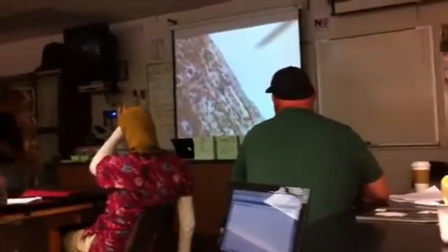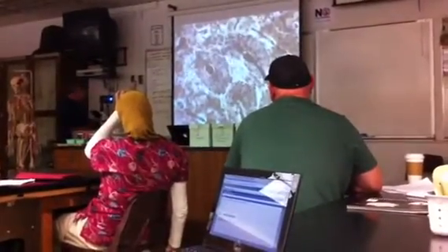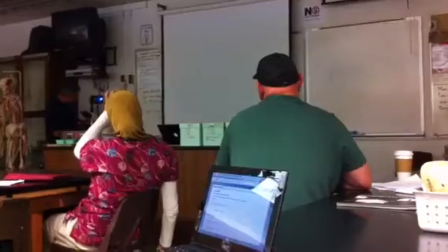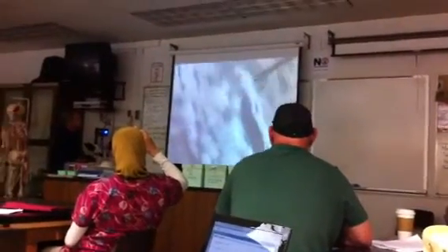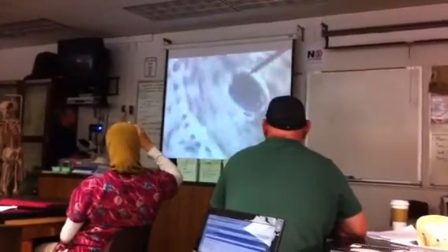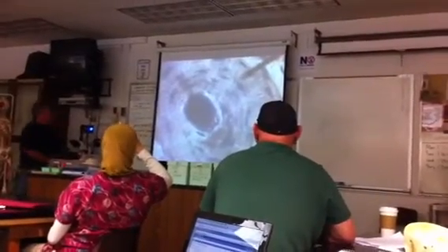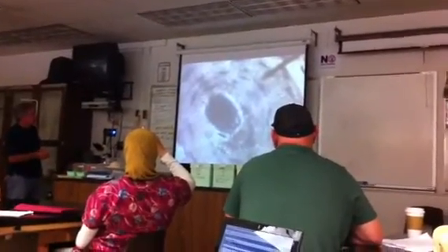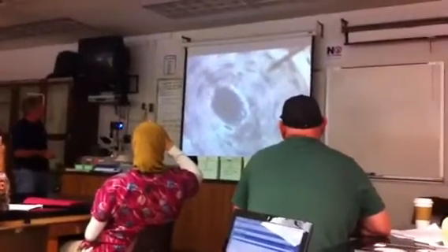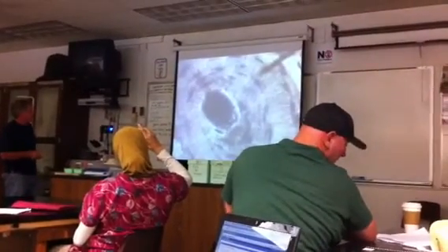And then if we move back into the bone at a little deeper level, let me just go to the highest power. It's actually not too bad. Anyway, now let me just get one osteon. There we go, the gigantic osteon. Well, that's actually pretty good. So you can see the central canal. These are the osteocytes. You see how they're laid down in a concentric pattern.